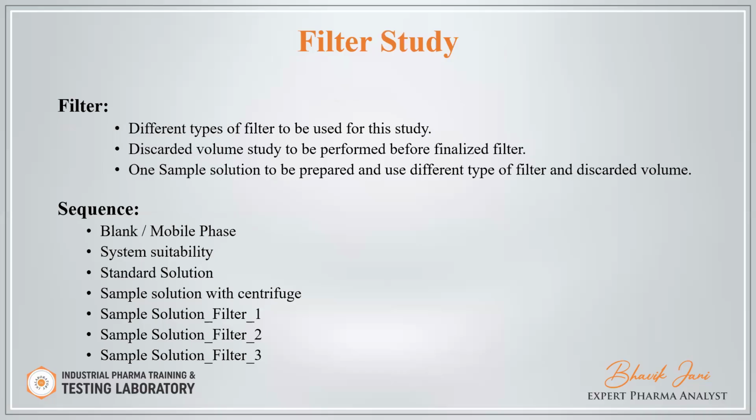The next is the filter study. For the filter study, you have to prepare the standard and sample as per the MOA. Then different types of filter are to be used for this study. A discard volume study is to be performed before finalizing the filter. You have to finalize the discard volume, and one sample solution is to be prepared and used with the different types of filter and discard volume.